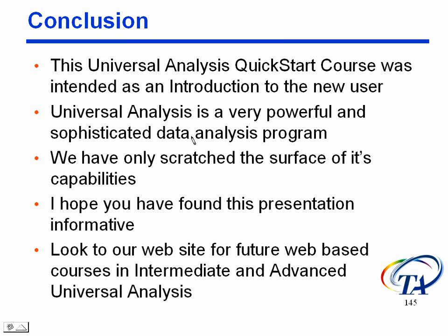I tried to make this an introduction to the new user. So I apologize if you were already beyond this stuff, but that's what it was intended for. There's another class which basically picks up where this class left off. So I hope you get the feel that UA is a very powerful and sophisticated data analysis program. We've really only scratched the surface of its capabilities. We go into them and basically pick up where we left off here in the next course.